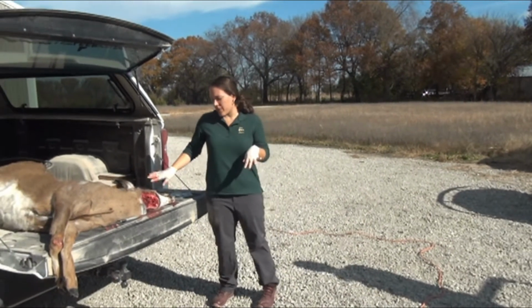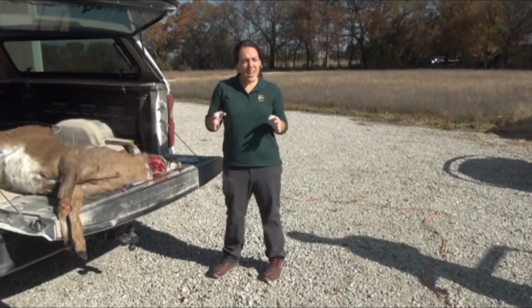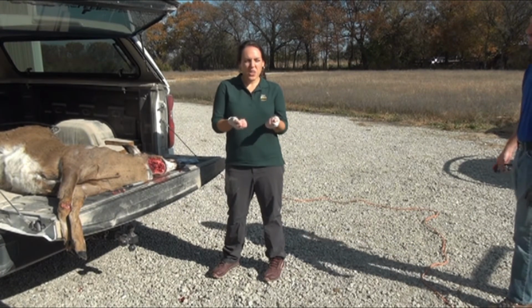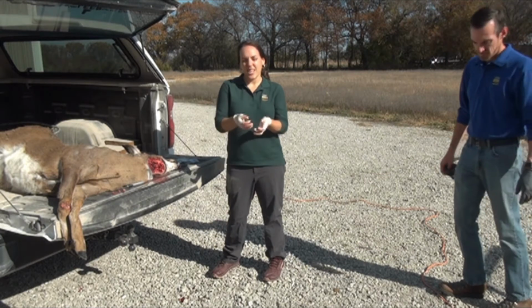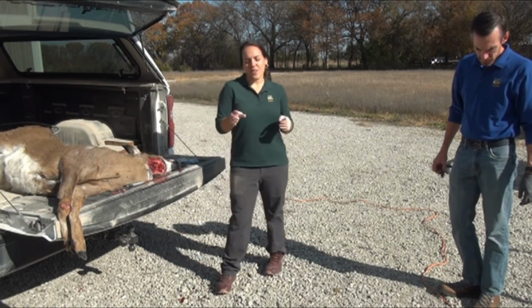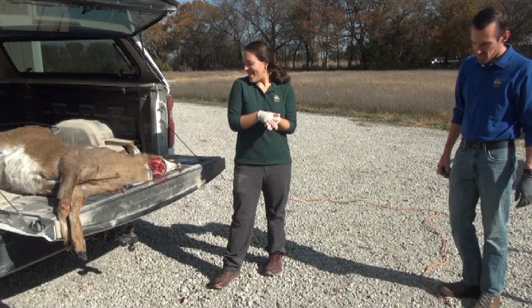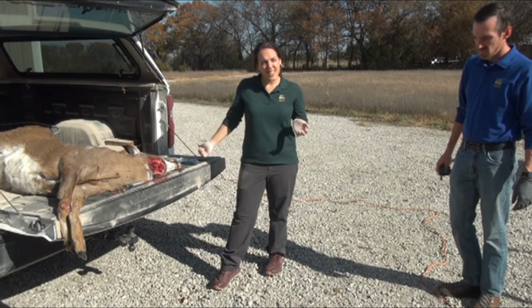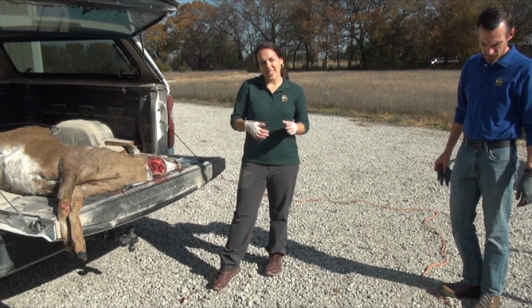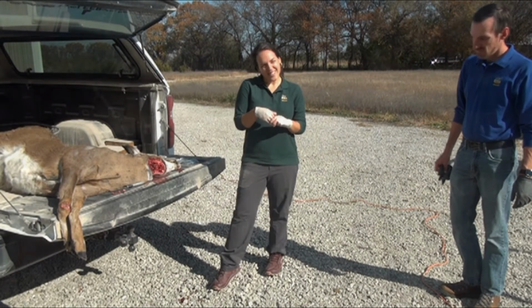So it's harder to appreciate when there's more blood and that kind of thing discoloring the area, but it's that feel, and then also you can kind of see it within its fascia, or the tissue that's holding everything in place, and then you can really target where you want to grab that sample. So next up, we're just going to put these in these bags. We have one bag for each, the A lymph node and the B lymph node, like Tyler mentioned, and we'll move on to our next deer head.